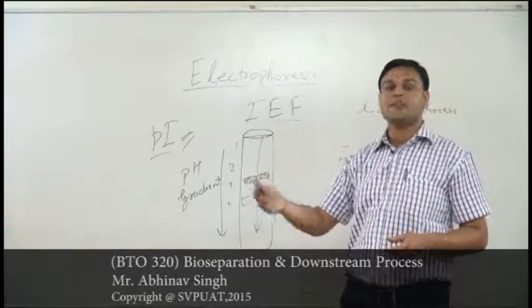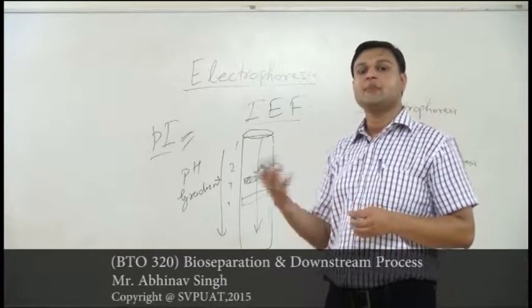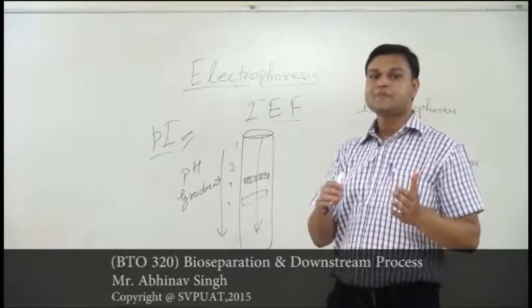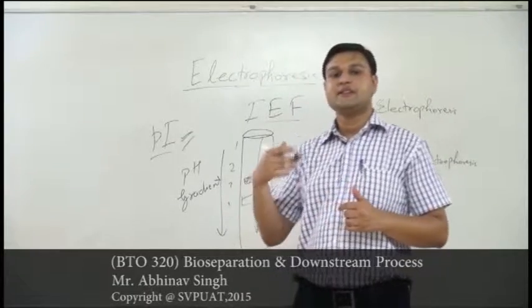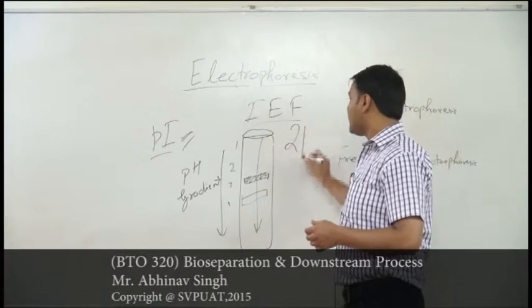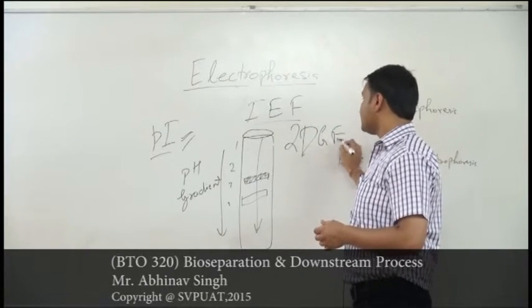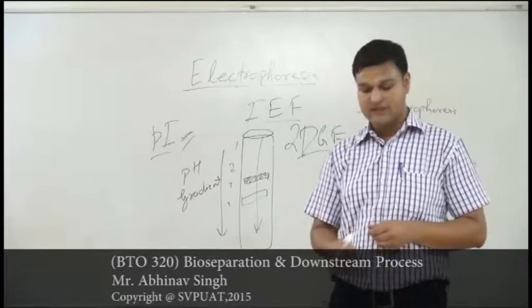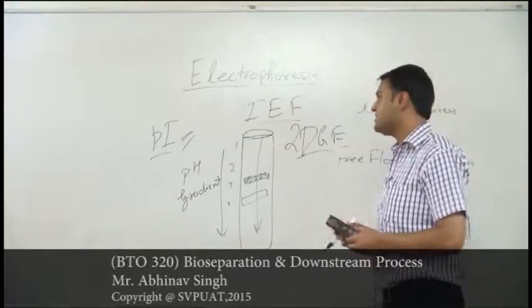This technique is continued with another technique, polyacrylamide gel electrophoresis, but these two techniques run perpendicular to each other. That gives one more advantageous technique, combinedly known as two-dimensional gel electrophoresis, abbreviated as 2DGE. Let's see what 2DGE is.